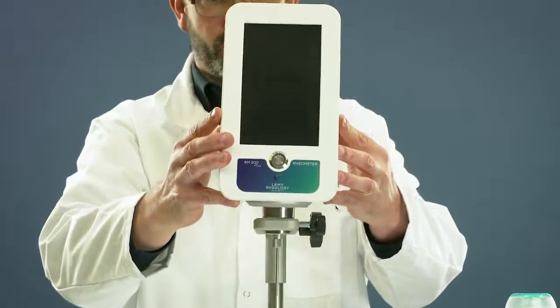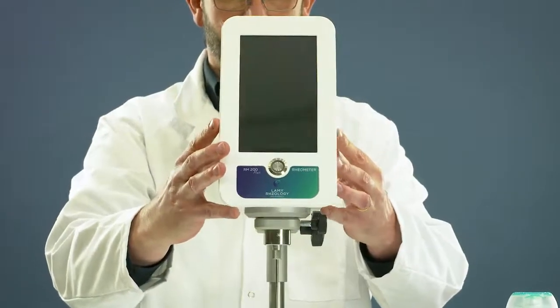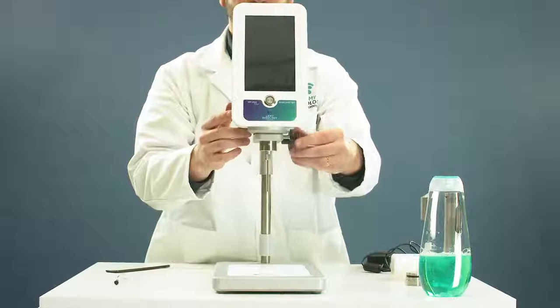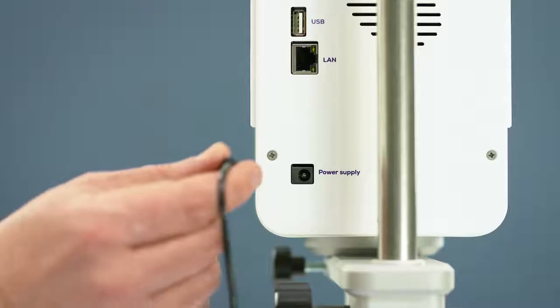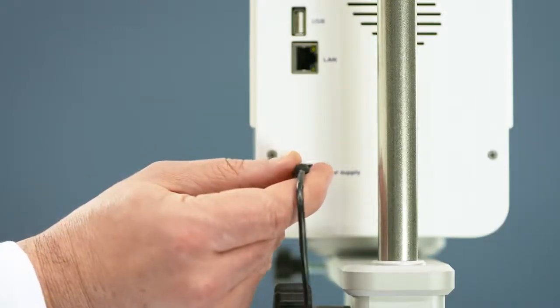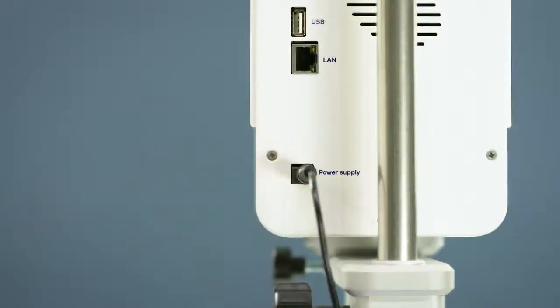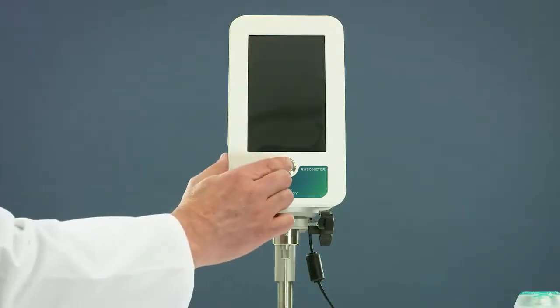Take the measuring head and install it on the arm, then lock the measuring head with the screw. Plug the power supply on the rear panel of RM200+ and switch on the viscometer.